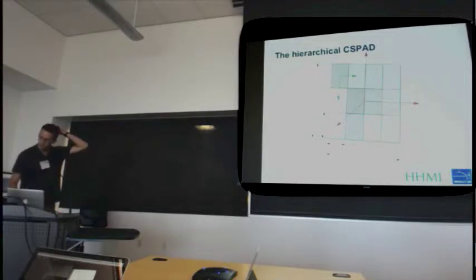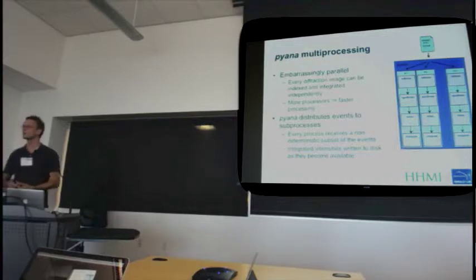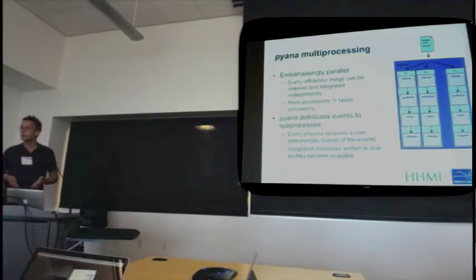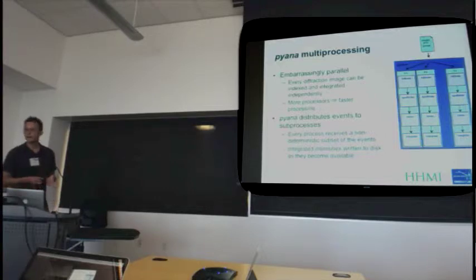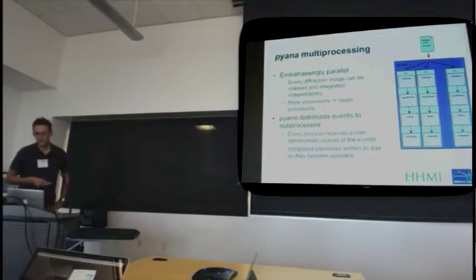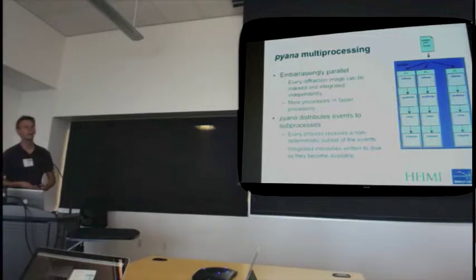Right, so this stuff about the methodology we've largely seen before. Another thing, as you're working as a developer on these things, it really helps if you can try things out fast. You don't want to be in a situation where every time you change something, you'd have to run it overnight to see the effect. One way to speed things up is to write better algorithms, but that takes time. An alternative is to throw more computational resources at the problem. And with these kinds of things, we are in a good situation of having an embarrassingly parallel problem, because every diffraction image can be processed completely independently of all the other diffraction images. That means, in principle, the more processors we throw at this problem, the faster we can push it through. That was the idea.